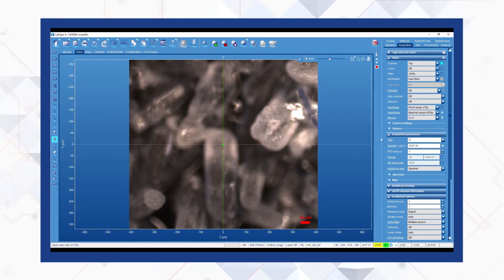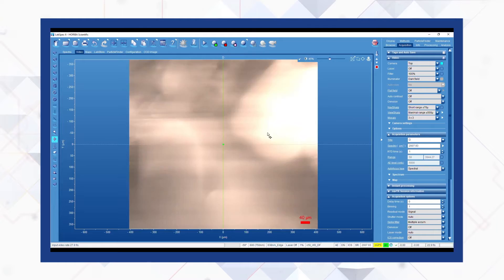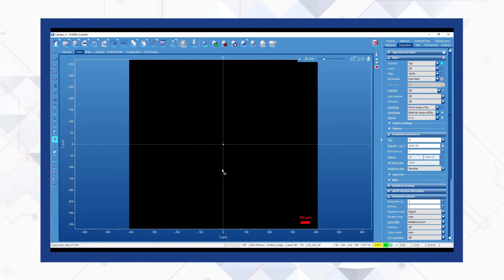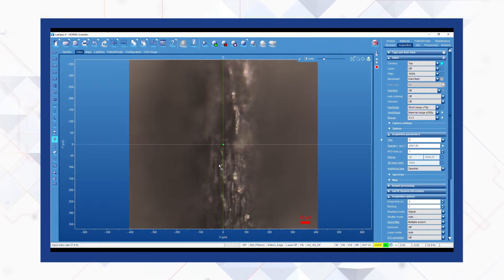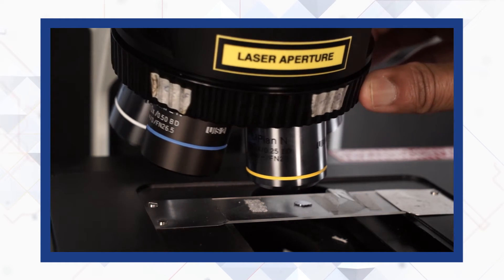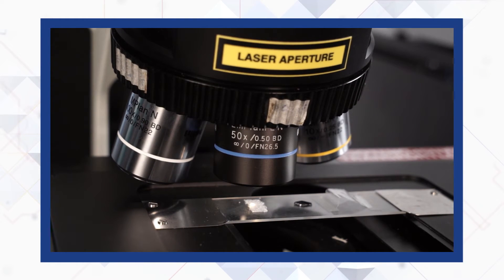Now we switch to the 5x objective and find an appropriate spot to focus. When we switch to 10x, we can easily focus again. Finally, we switch back to the 50x and we see that even with rough samples, finding focus is easy after stepping through lower to higher magnification objectives.